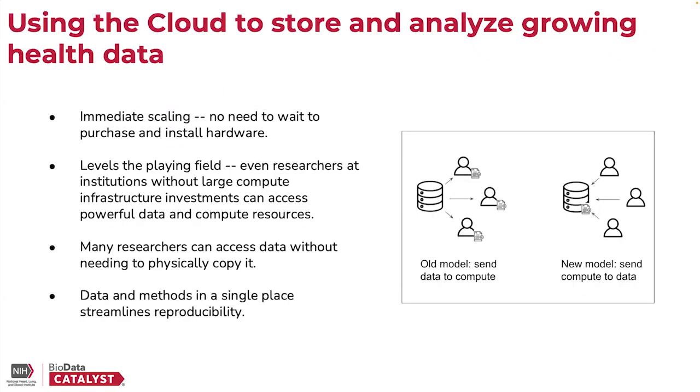And so why would you want to bring your data to BioData Catalyst? The first strength of the platform is that there's immediate scaling. You don't need to wait to purchase or install any hardware or have software that needs to be installed on every computer in your lab, with you paying for licensing for every computer it's installed on. It really helps to push forward a lot of data analyses.